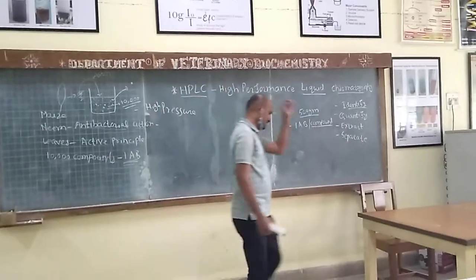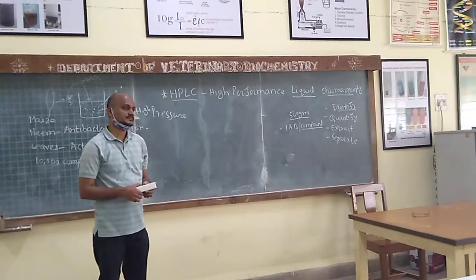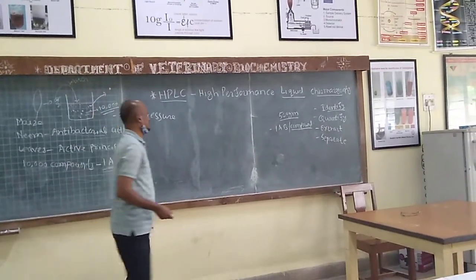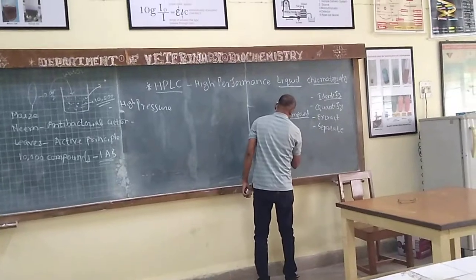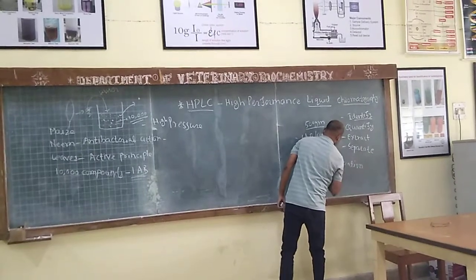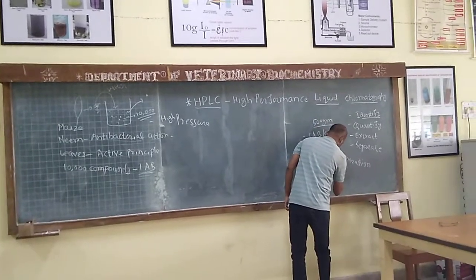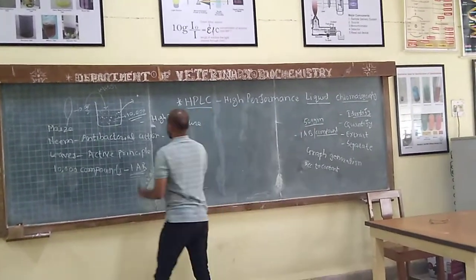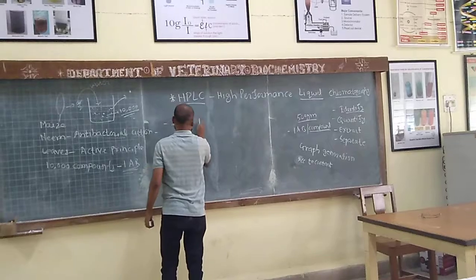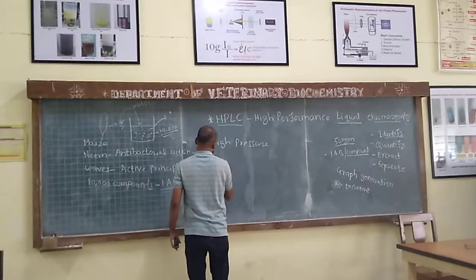Pressure. You write this in the book. Pressure is one thing, right? So what are the next things? There might be graph generation according to the content. Next word is liquid phase. First one, high pressure, right? Which are liquid phases?